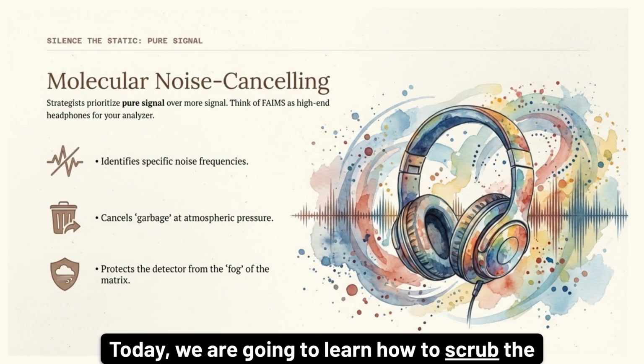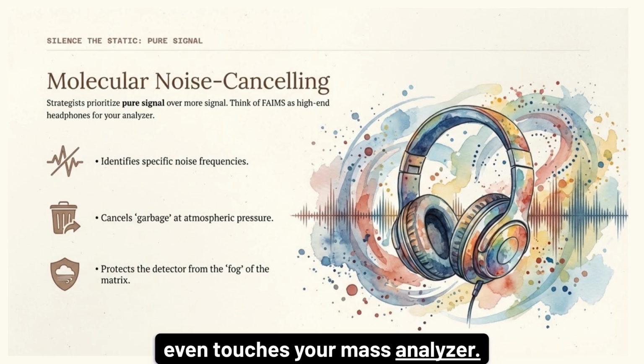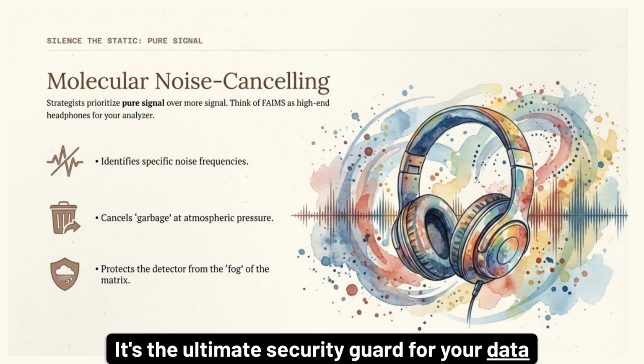Today, we are going to learn how to scrub the garbage away at atmospheric pressure before it even touches your mass analyzer. It's the ultimate security guard for your data clarity.